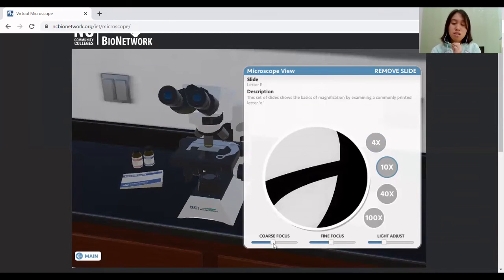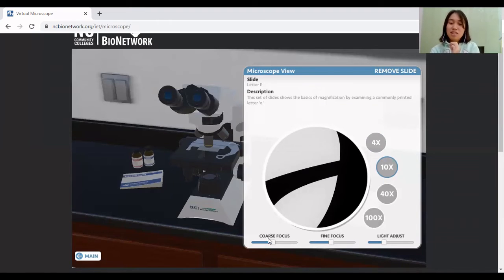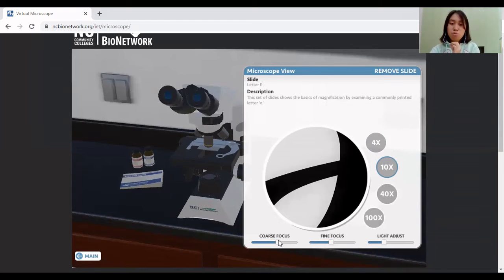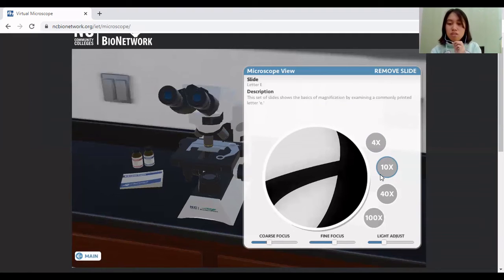And as you can see, if you adjust this, the stage also moves. So if you move this forward, the stage will also move upward, even the fine focus, but the movement is slower.